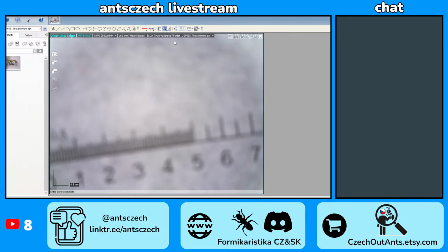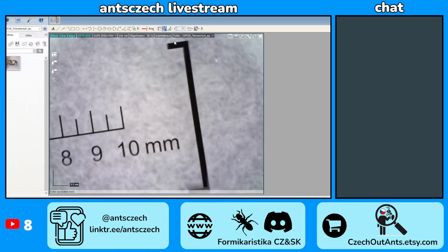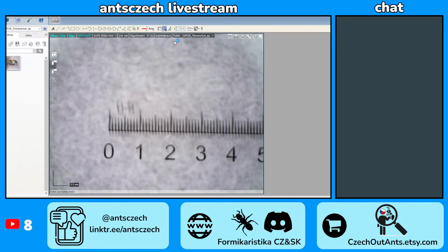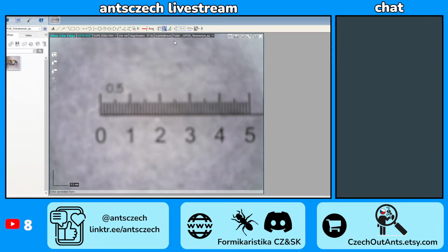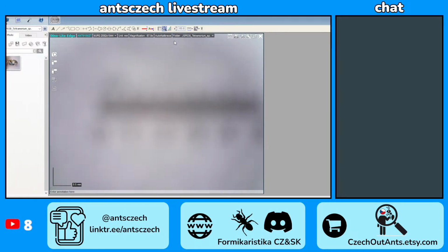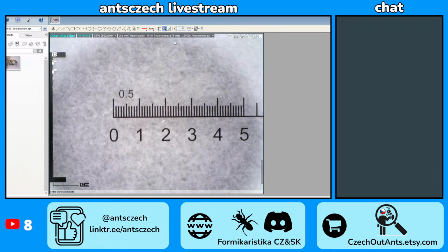It's pretty expensive for a digital camera, I would say. But there are definitely much more expensive ones. What I mean is that I would expect the light values to be a little bit better than they are. But what can you do? This camera is not mine. It's in the Department of Zoology.